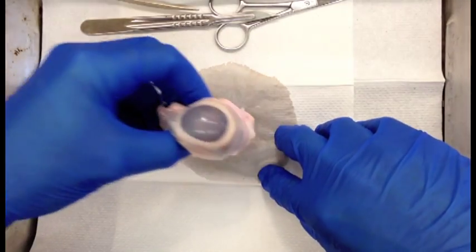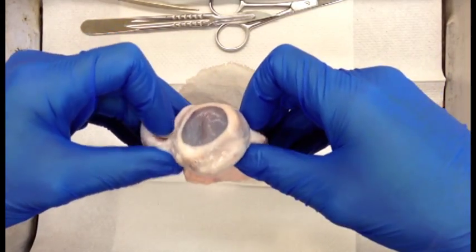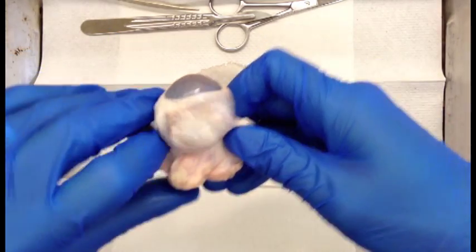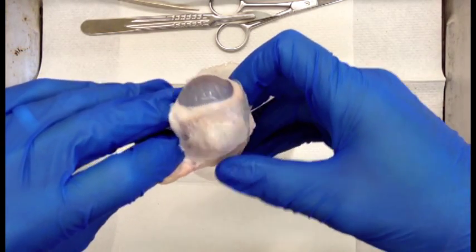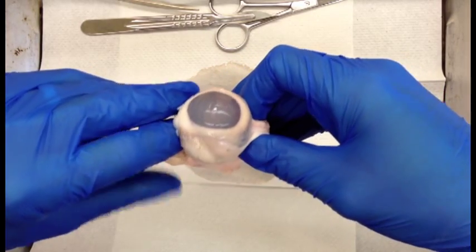I'm going to dissect a cow eye. This particular cow eye is a fresh eye, meaning it has not been preserved. So a lot of times for dissections you'll get a preserved eye. It's been preserved in formalin and then soaked in alcohol.